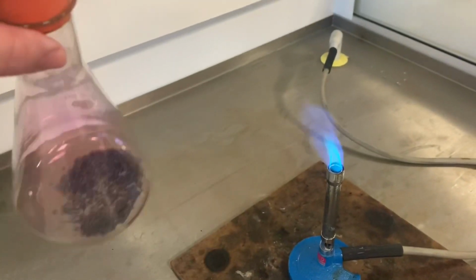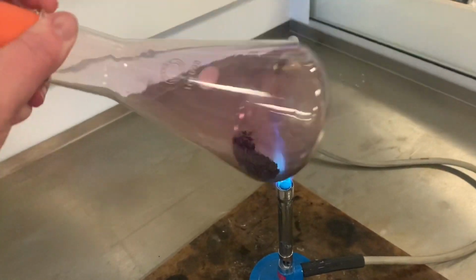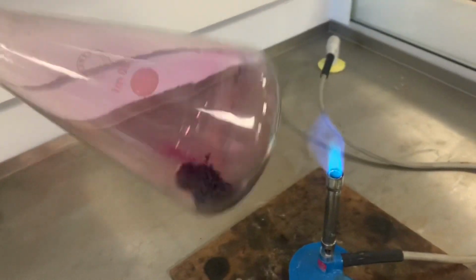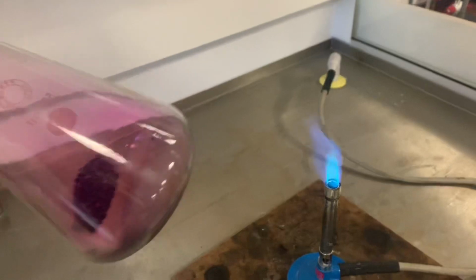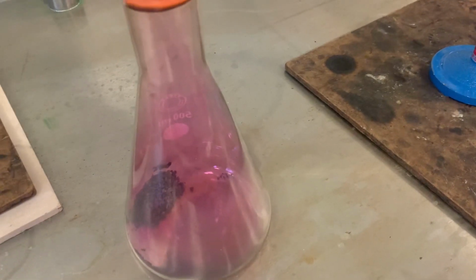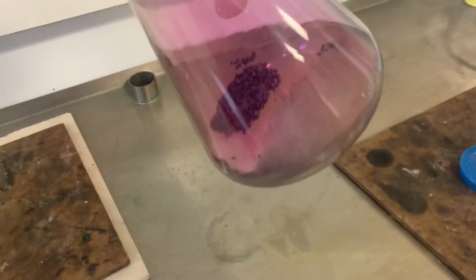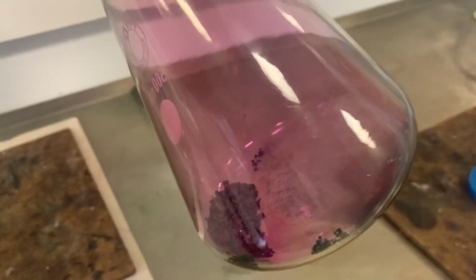So inside the conical glass, not sure if you can see it, you've got some purple gas. More purple now. See? And if I let that sit and it cools down again, we will get some grey solid forming on the sides of the flask. So there's no liquid iodine, it goes straight from being a grey solid to being a purple gas.